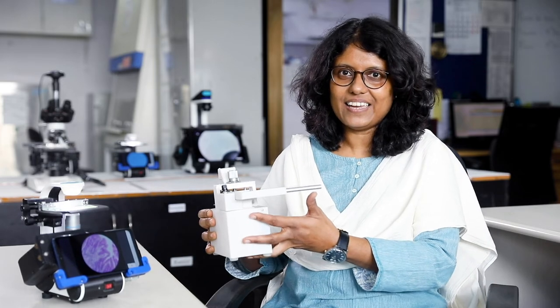Hello, I'm Debjani Paul. I'm a faculty member at the Department of Biosciences and Bioengineering in IIT Bombay. This microscope started as a master's project of my student Samrat, and this is what it looked like when he graduated, and this is what it looks like today. After graduation, Samrat started a medical devices startup company called MedPrime Technologies with three of his classmates and continued the development of this microscope. The entrepreneurship ecosystem of IIT Bombay has played a major role in the development of this product, from an academic project to a commercial prototype.